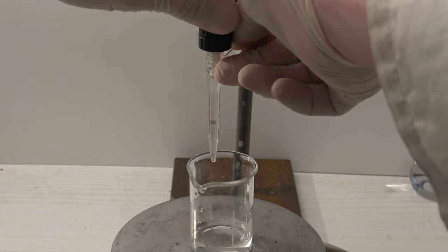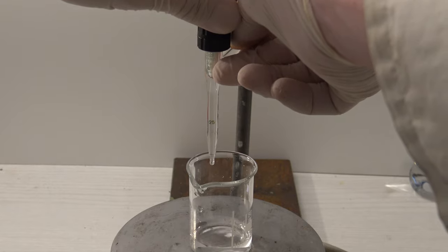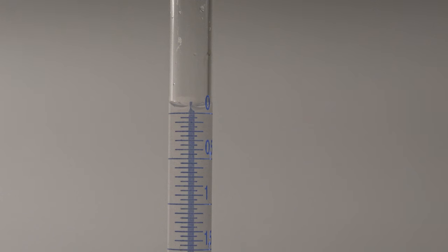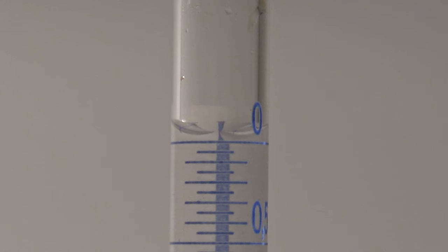Then the level of the solution can be adjusted to the highest marking. The meniscus causes the broad line on the back to taper, making it possible to read the values precisely.